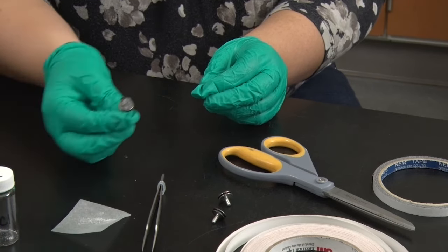All of the imaging I've done so far has been with a secondary electron detector. If I switch to the backscatter detector, it's clear that the contrast mechanism is different. These two images are of the same salt crystals, but with two different detectors. The one on the left is a typical secondary electron image showing the surface topology. The image on the right is a backscatter image, which shows more atomic number contrast.